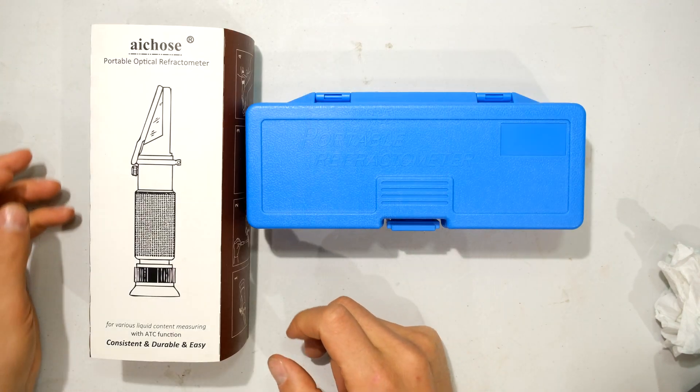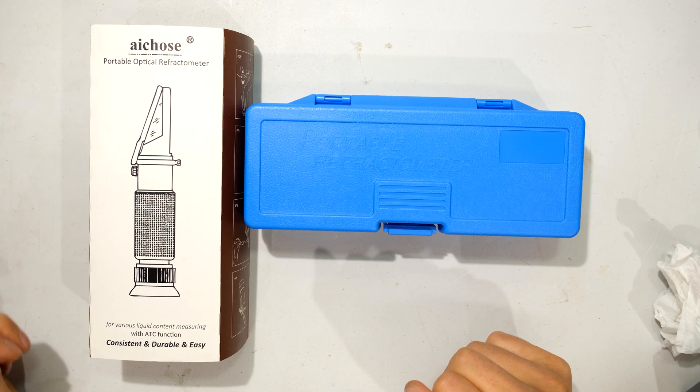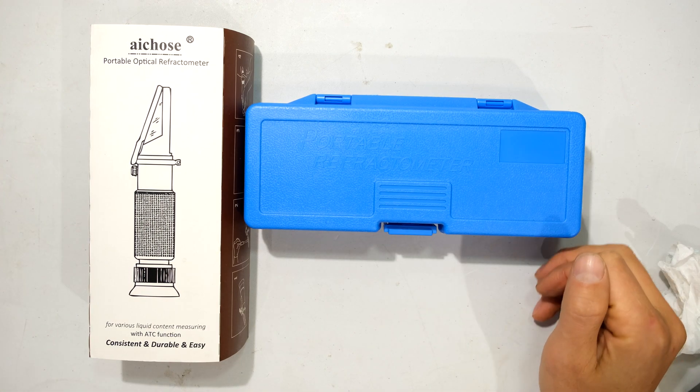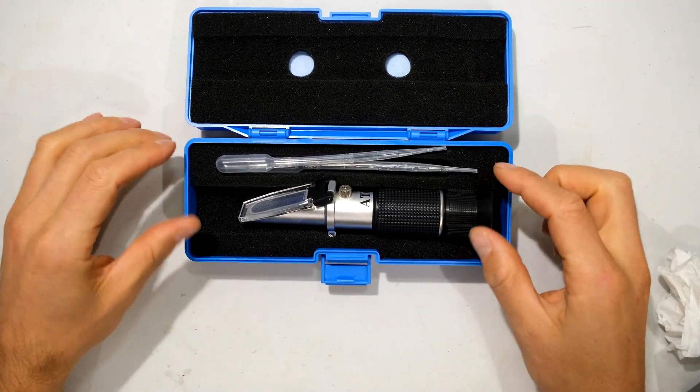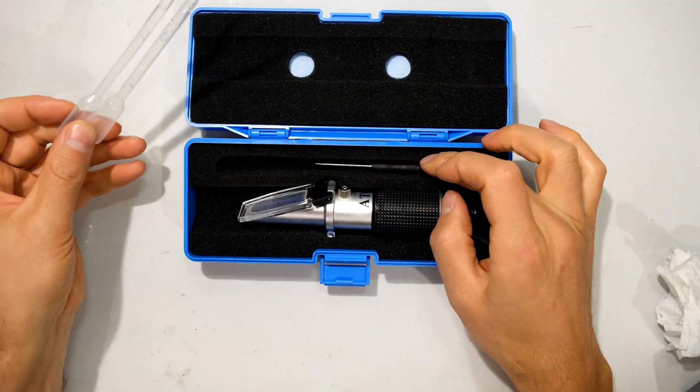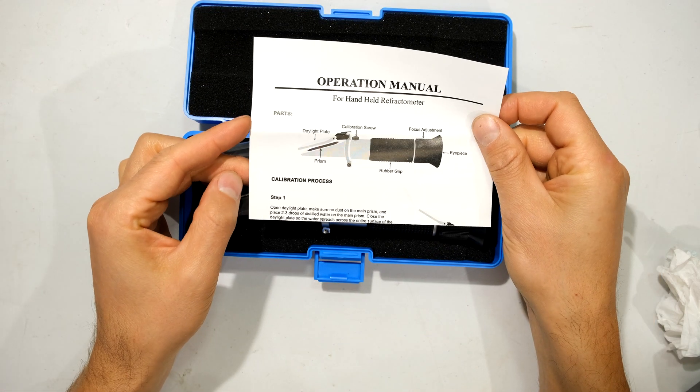This particular refractometer comes in a little kit. This is the brand I got on Amazon and it cost about $20. Inside the carry case you've got the portable refractometer, two droppers, a screwdriver to perform your calibration adjustment, and a leaflet explaining how to take the measurements.